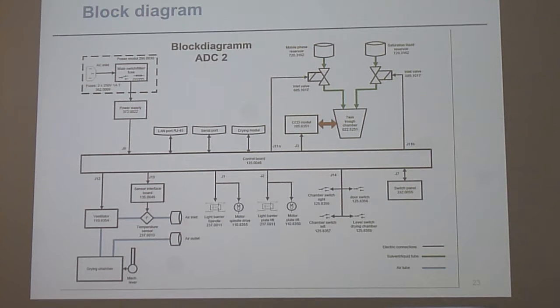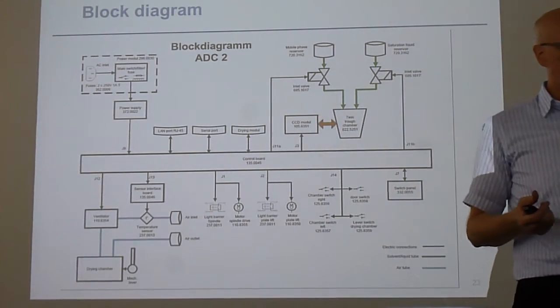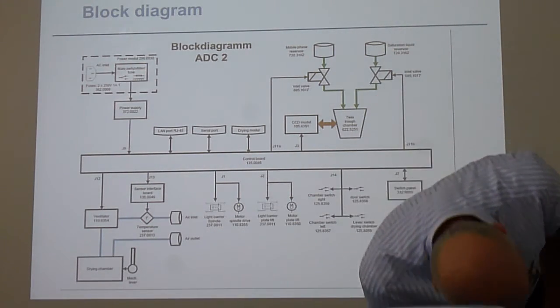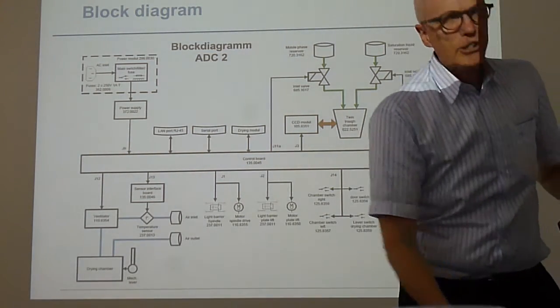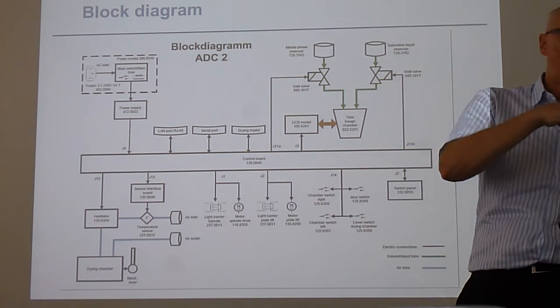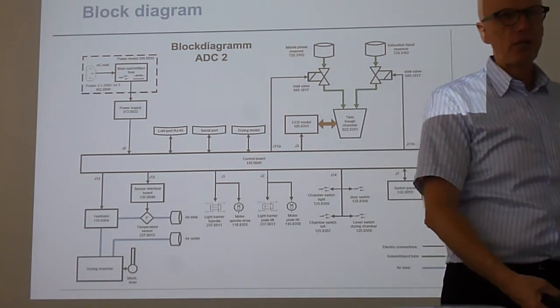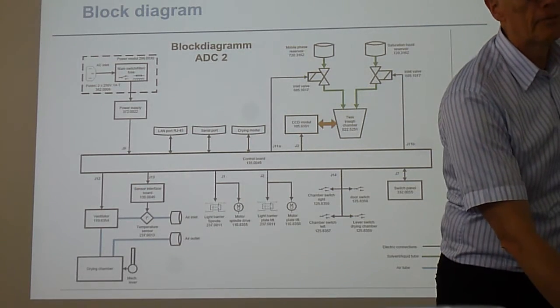So sometimes it happens that you get the information from the customer that development is taking very long, or even the instrument stops developing and says there is no development solvent in there. The reason for that is most likely that here from the mobile phase, in the valve or from the tubing from the valve to the twin trough chamber, there is some dirt. So if the customer doesn't put these lids on, underneath here are the inputs. What we usually do is we take the air and open with the service mode. We open the service mode, and then we clean it like that. Make sure that you have some cloth or paper, because sometimes it is really something.